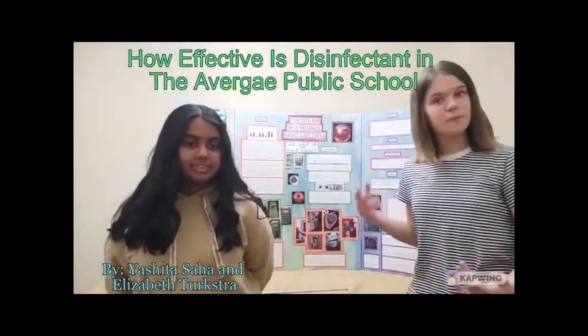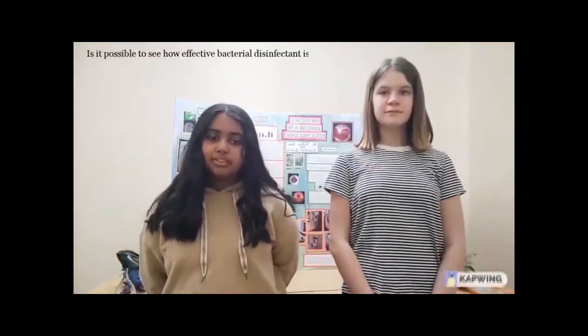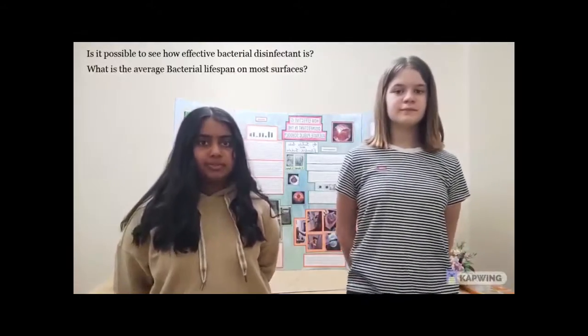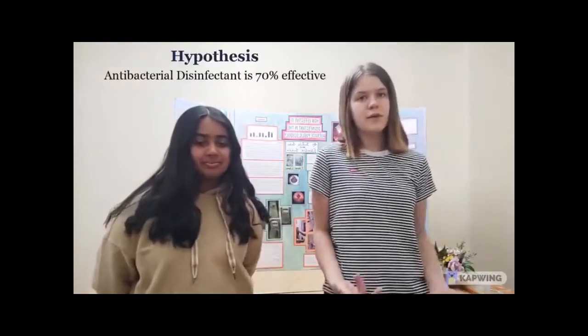Our project is, drumroll please, how effective is disinfectant in the average public school? To go more in depth, is it possible to see how effective bacterial disinfectant is? What is the average bacterial lifespan on most surfaces? Our hypothesis was that bacterial disinfectant used in schools is about 70% effective.